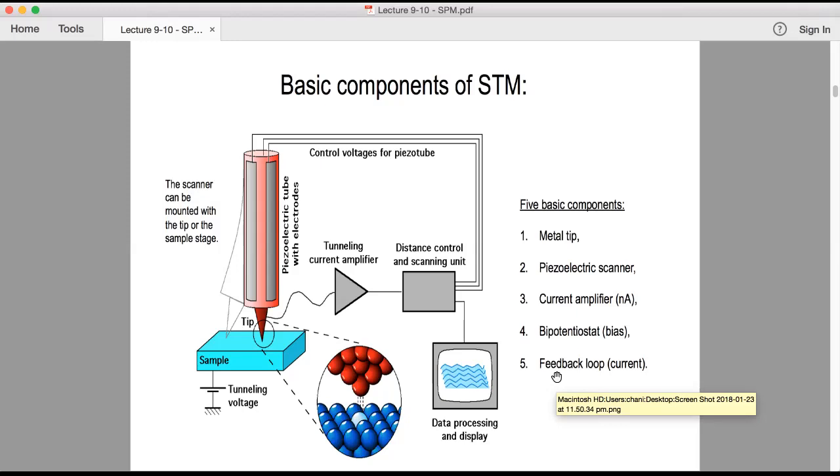There are many different forces that may cause the deflection, such as mechanical forces, electrostatic, magnetic, chemical bonds, van der Waals, capillary forces, so many forces. The data from the laser reflections is detected by photodiodes and combined to generate an image by the computer. The image actually has no color because it is just a representation of the properties rather than the light. But we artificially give them false colors, so it is easier for the observer to differentiate the different properties of the specimen.